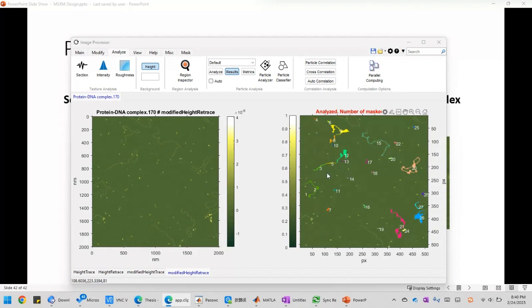The benefit of doing bulk particle analysis is that it's high throughput and it's like an automated procedure. But the downside is that we do not have enough information on things such as position property.